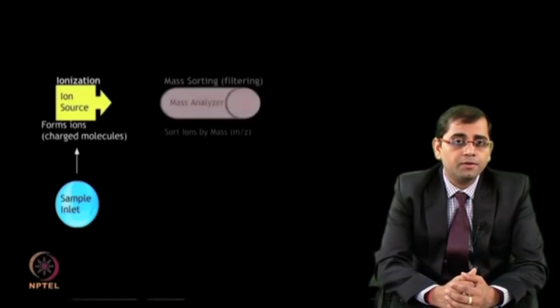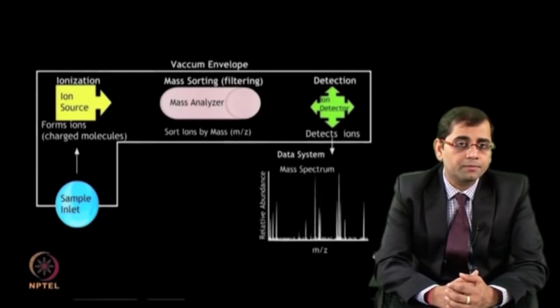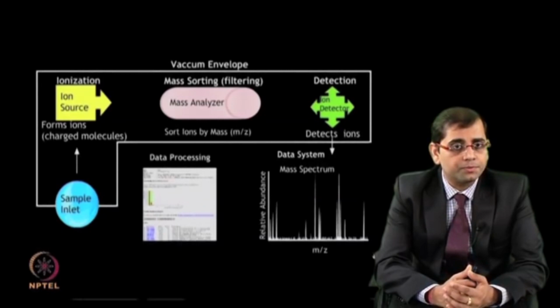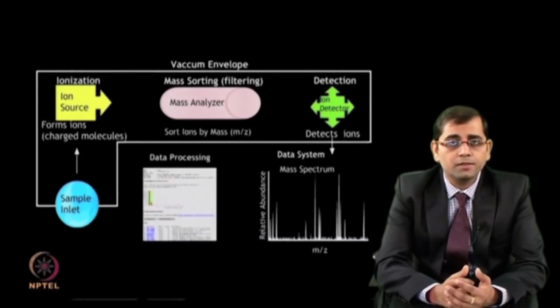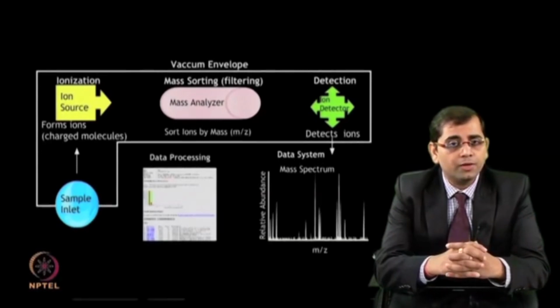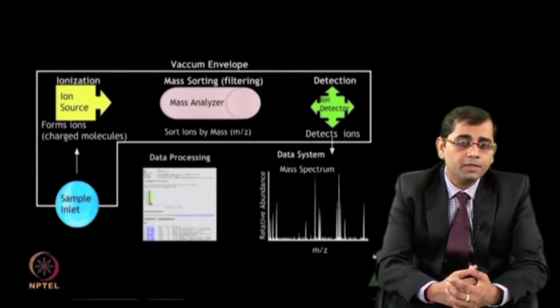In lecture 5, we'll talk about the fundamentals of mass spectrometry. Mass spec is a highly sensitive balance to measure the mass of the molecules in vacuum based on mass to charge ratio. It consists of an ionization source to ionize the molecule, a mass analyzer to resolve the ionized molecules in vacuum, and a detector to read the signal coming from the mass analyzer.